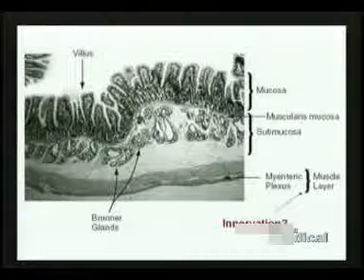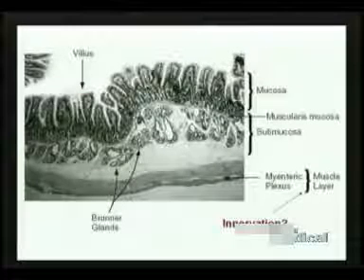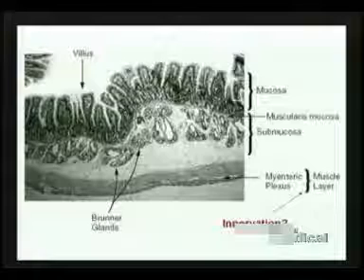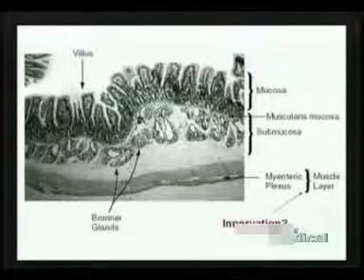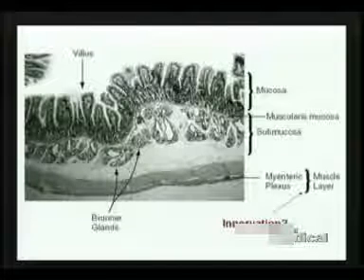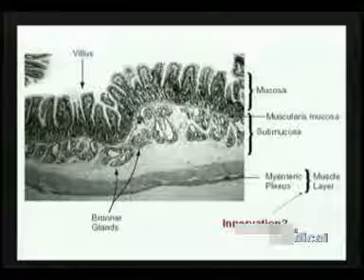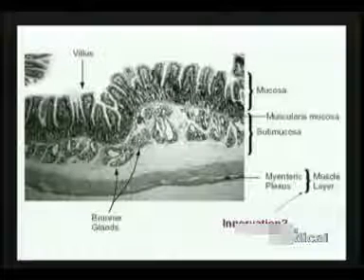Finally, in terms of histology, this picture is a distinct view of a section through the duodenum. Certainly we can see the villated columnar epithelium intermingled with the crypts of Lieberkühn, but what tells us this is a duodenum section is the presence of the prominent submucosal Brunner's glands.